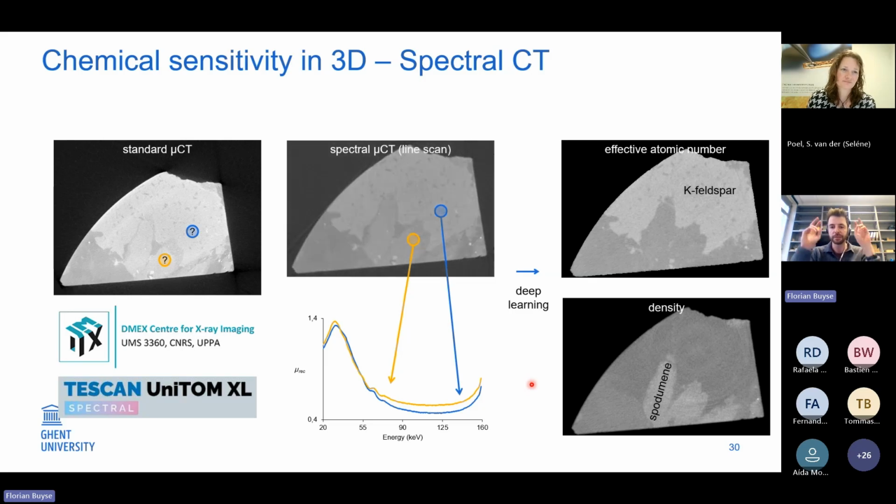It doesn't need me, for instance, anymore, or a geologist. Without interference of me, it will give the different phases. Eventually, it's up to you to incorporate your knowledge on the material itself to see what this differentiation between the minerals is actually identifying. But it's possible, I would say, yes.